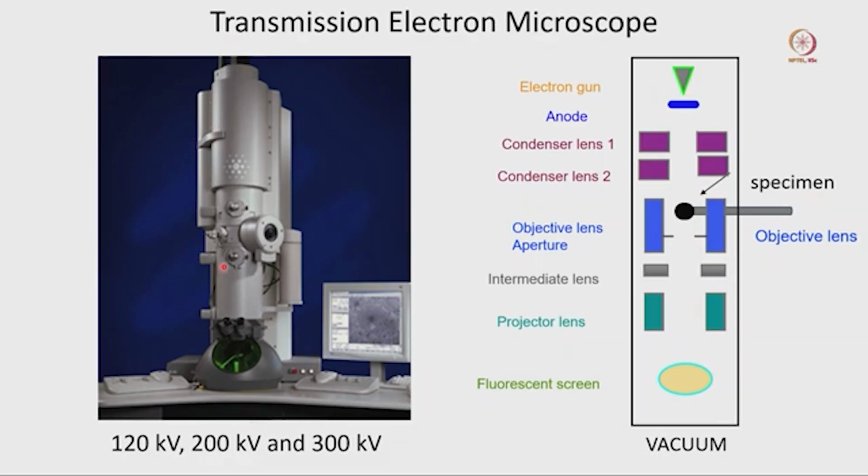So, generally electron microscopes are very big. When I was discussing the history of the transmission electron microscope, you saw a large cylindrical column shape. Here also you can see a cylindrical column, a similar architecture where we have the filament or electron gun at the top, and multiple other parts connected with this cylinder, where we have different kinds of lens systems, as I mentioned, condenser lens or objective lens. Now, we are coming to that particular diagram, we want to see it inside.